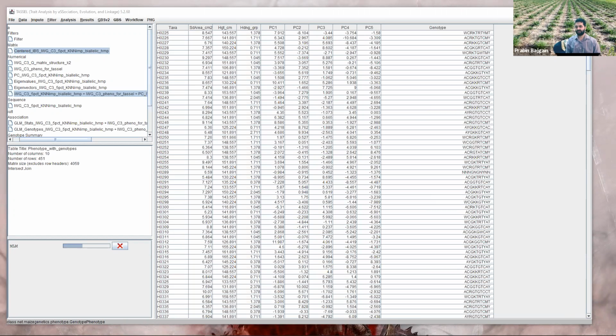So there are other options, where you have multi-loci models. One of the common ones you might have heard of is FarmCPU. There's also, I think, MMLM, the first M for multi-MLM, something like that. There are a few options that you can explore, and I think both MMLM and FarmCPU are available as R packages, if you wish to try, at least for a couple of traits, MLM versus a multi-loci model.